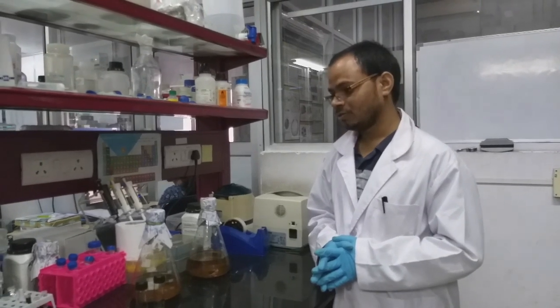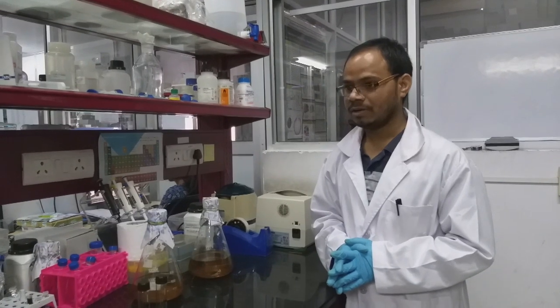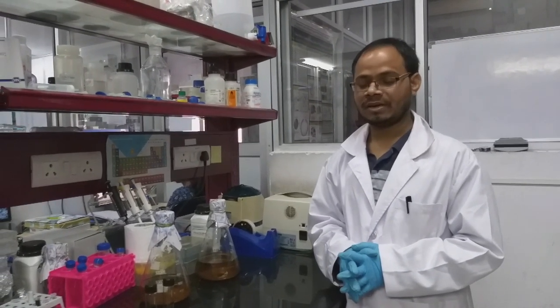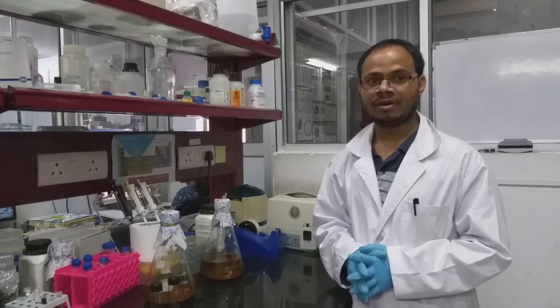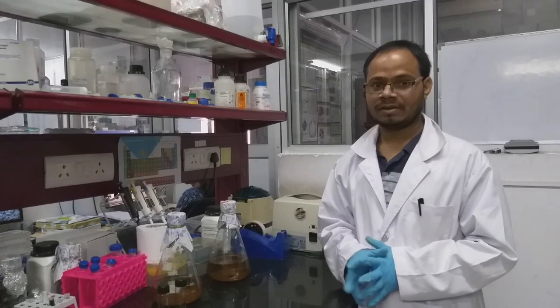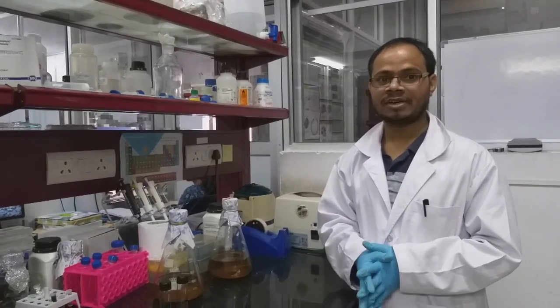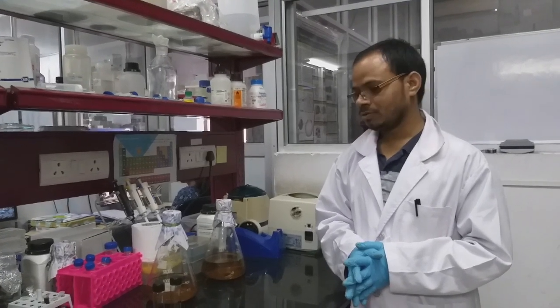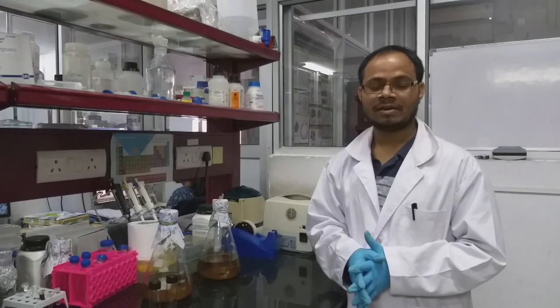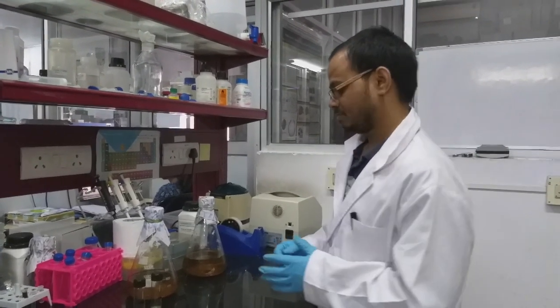And also we have to remember we should include a suitable resistance marker like ampicillin or kanamycin, these kinds of antibiotics, depending upon what resistance vector you have. In this case we are using ampicillin as the antibiotic. So let's start.